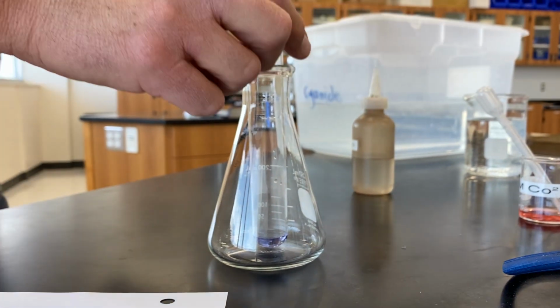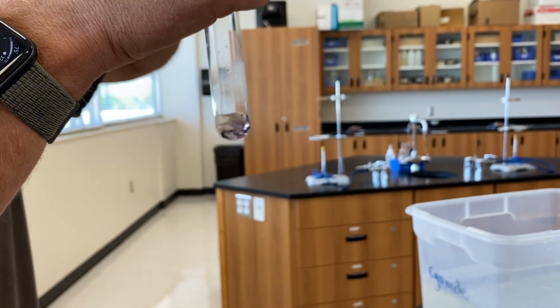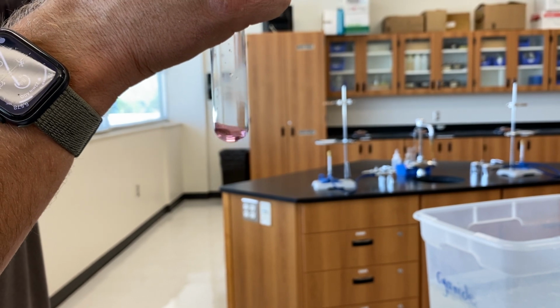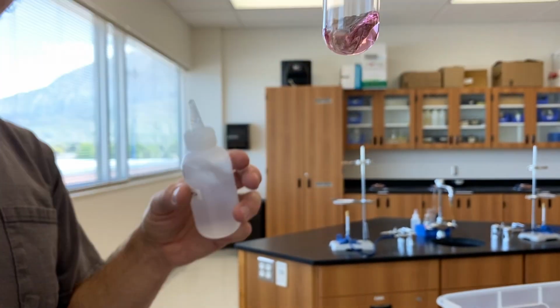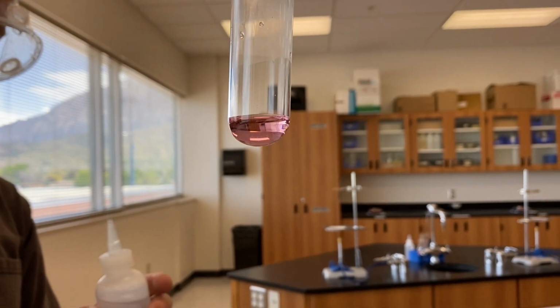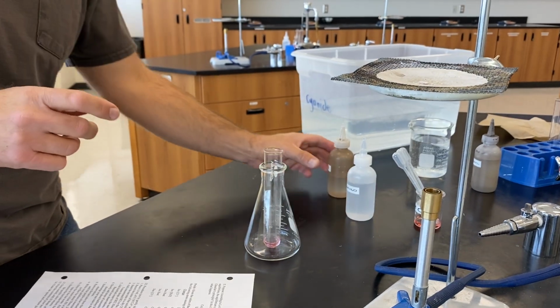What we're going to do now is we're going to add distilled water, also drop by drop, until we get a similar color change, like so. And you can see that change very clearly. Oh, good. Yep. All right. So that takes us through the end of step 5. Again, record that color change.